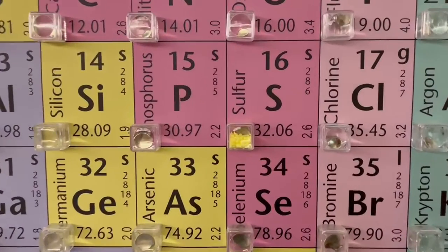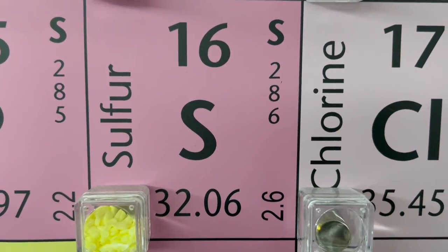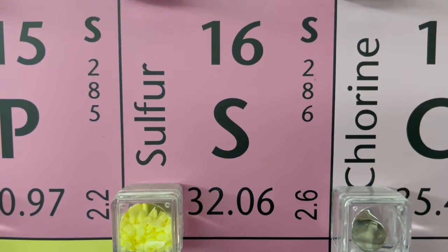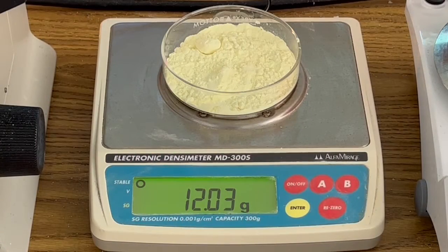Remember, sulfur is a non-metal. It has 16 protons. Its melting point is 115 degrees centigrade. It's found in soil, plants, food, and water. And remember, it's an essential nutrient for plants. So the first step is I'm going to measure out 12 grams of sulfur.